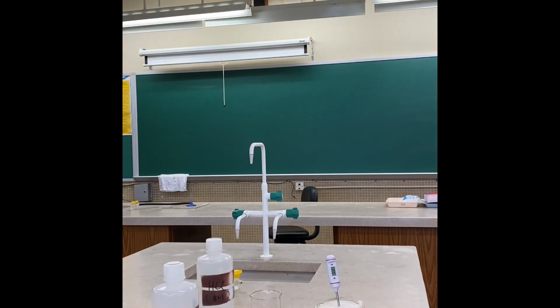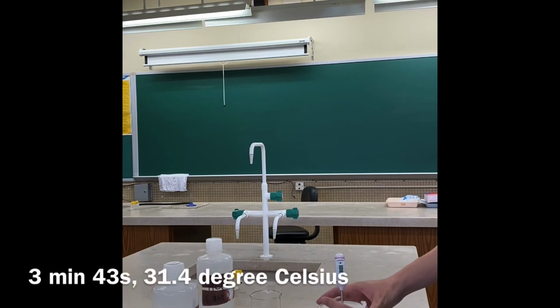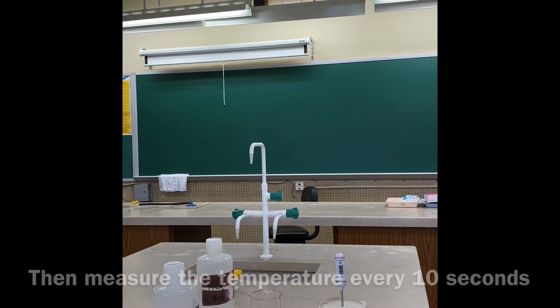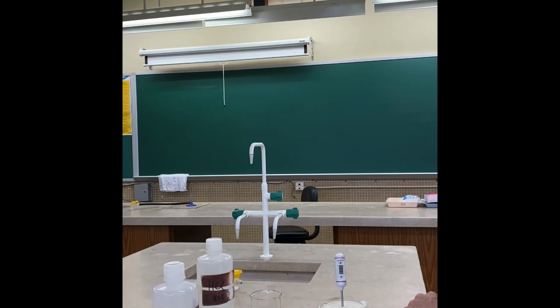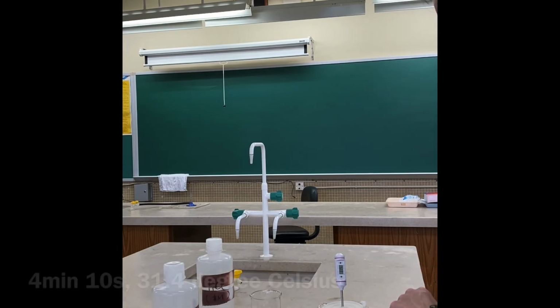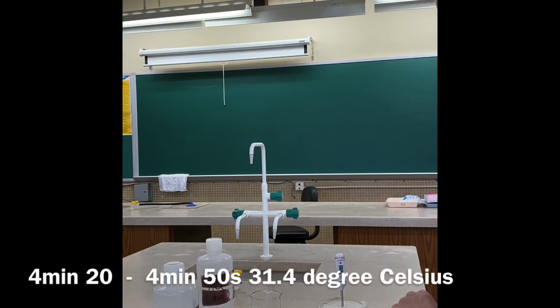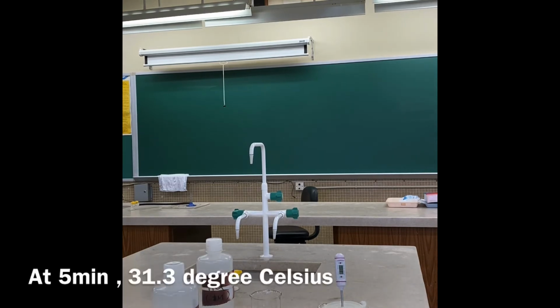It's now 31.2, and occasionally you can stir it. 31.4. 31.5. 31.4. 31.3.